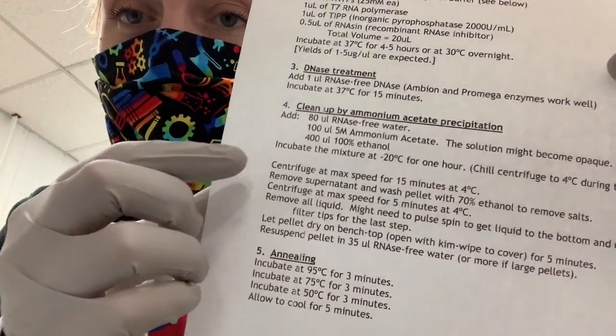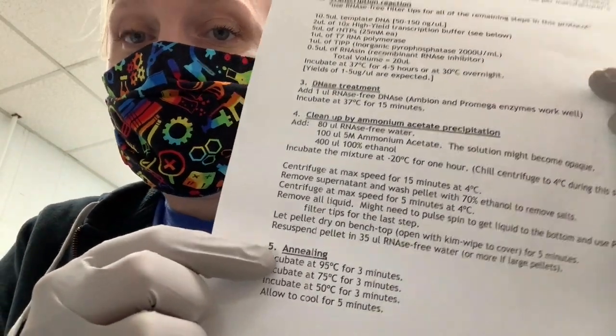The other thing you can go ahead and do is, if you plan to pour and run a gel after your purification, you can pour that gel during the 1 hour incubation as well. So I'm going to go do that. The other things you can do are just make sure that you've put everything back. You should have put away the high yield transcription buffer right after you'd used it, but just in case you didn't, put that back in your freezer box. And then the next steps will be to continue this protocol with the centrifugation steps and the annealing. And I will be back in a moment.